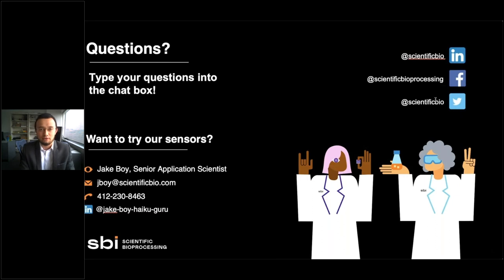That's great, thank you. I do have another question from Alicia Hen. Have you thought about using a non-oxygen permeable material for the device, except for between the channels?